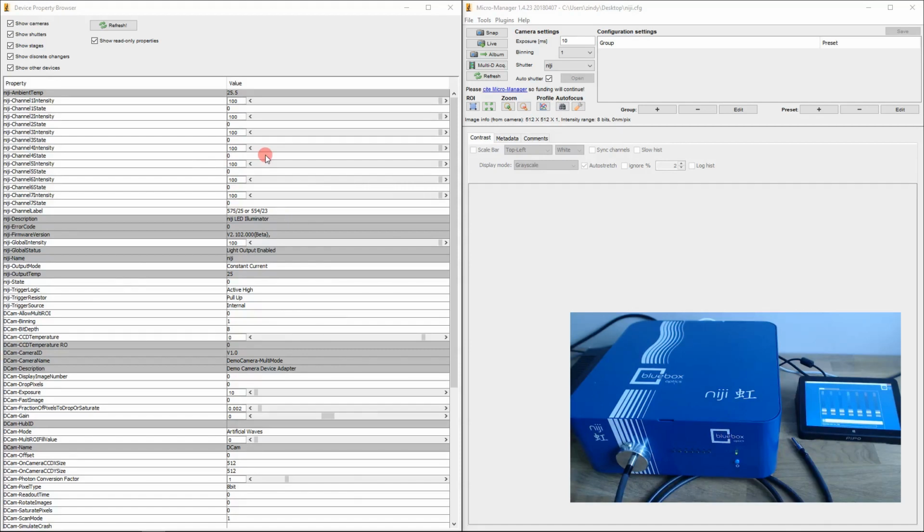Two things we want to control from Micromanager is which channel is on and at what intensity. So if we want to switch a single channel on at a time, we have the channel label. So this will select one state at a time. Or we can set the individual channels on and off in a preset, for a group comprising all 7 states.